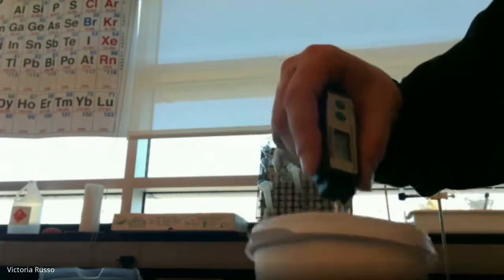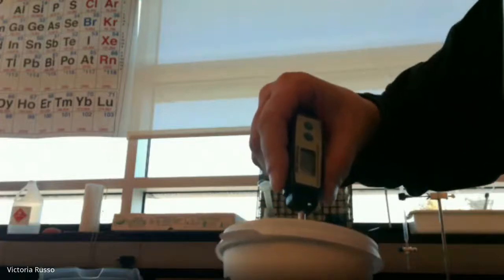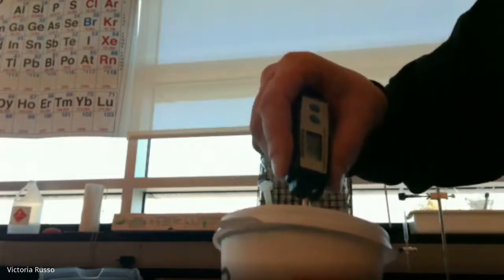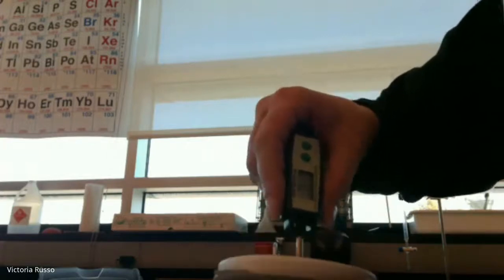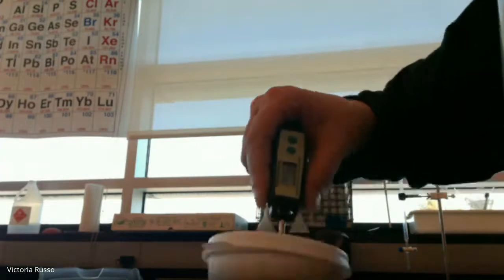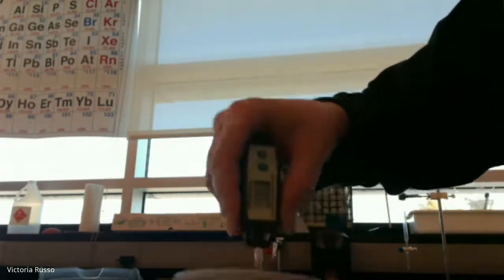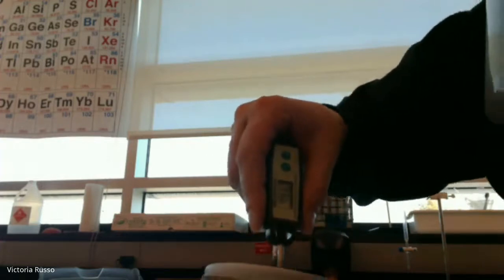All right, we're going up slower now at 39. Bubbling is still occurring. I can hear it. 39.1, 39.2, 39.5. Oh, it went up to 40. Reaction is really starting to occur now. Shake a little bit. It's getting warm to the touch now. It's at 44.